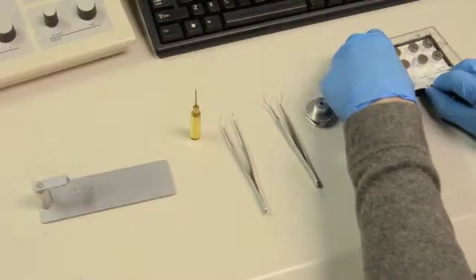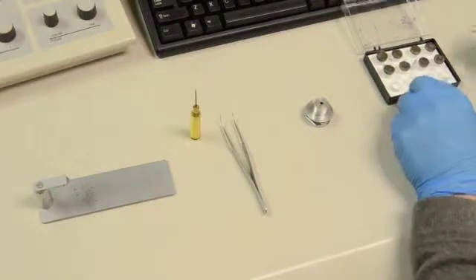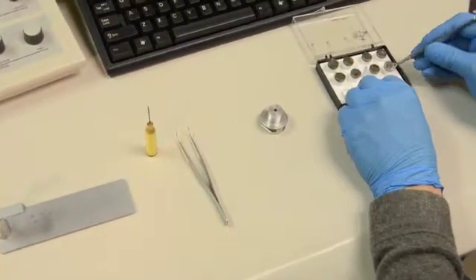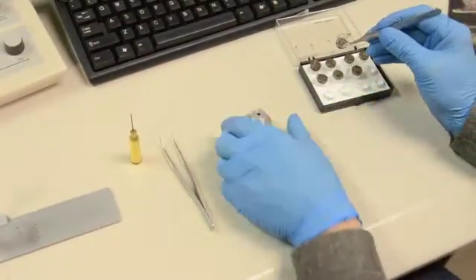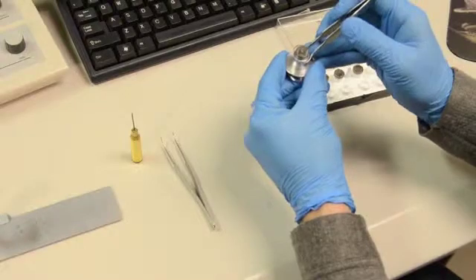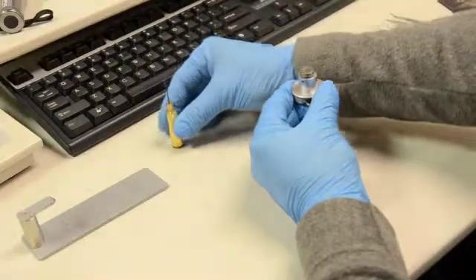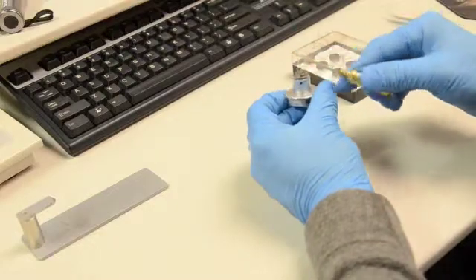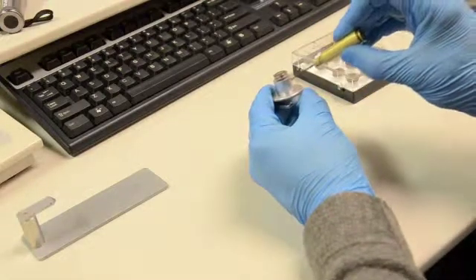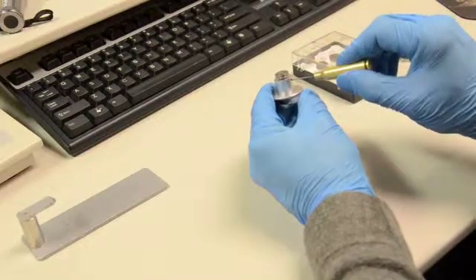Select your sample and pick up the SEM stub with the curved SEM stub forceps. Place the stub into the sample holder. Slowly tighten the small set screw using the Allen key tool. Be sure to only tighten enough to hold the stub securely — it is very easy to strip out the aluminum.